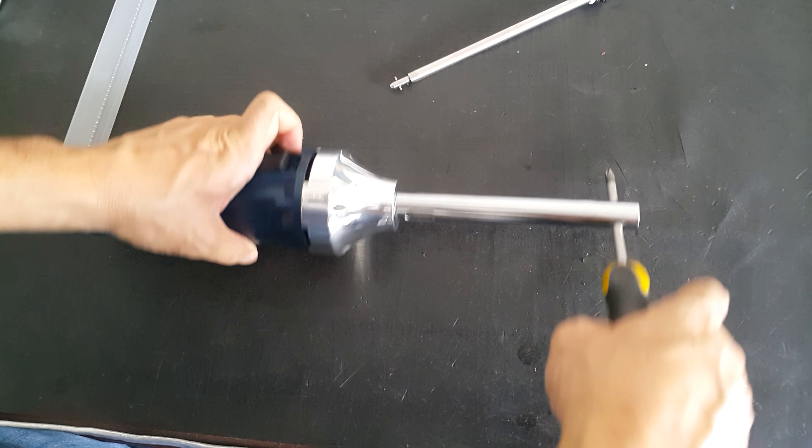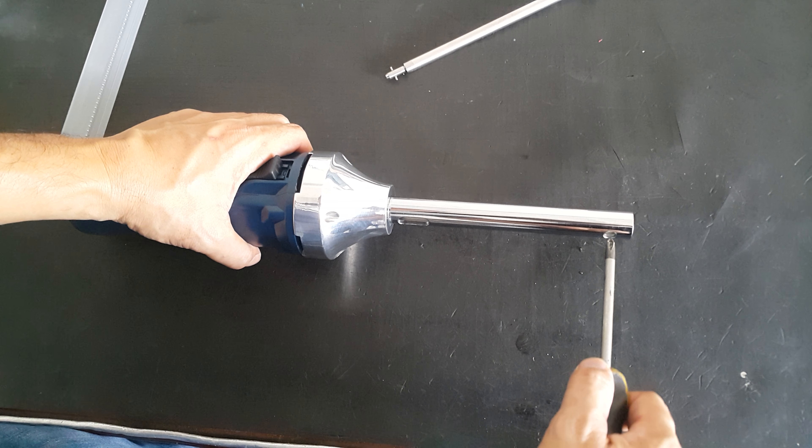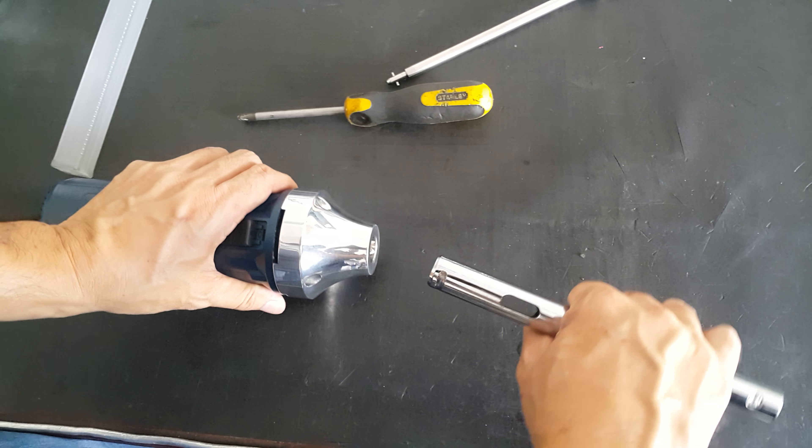Turn it up and turn it on, then take out the wheel.